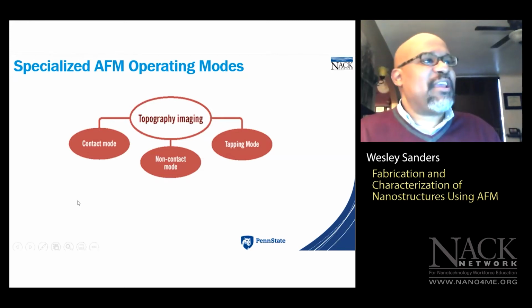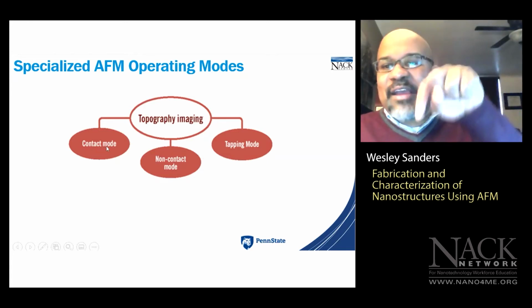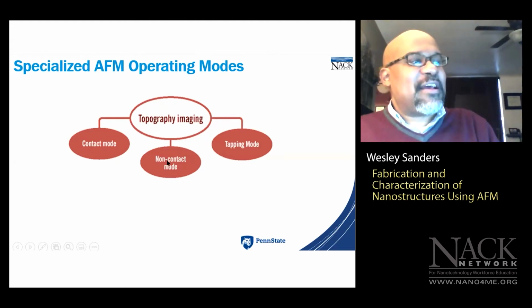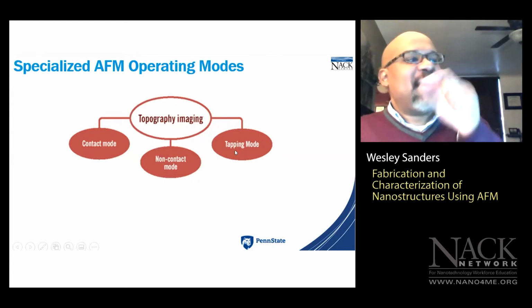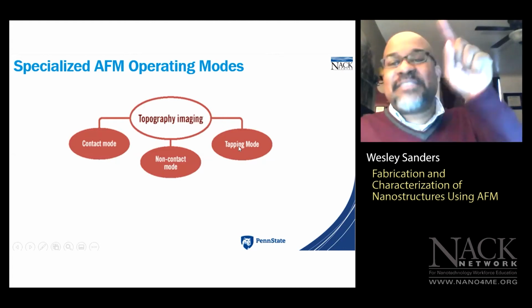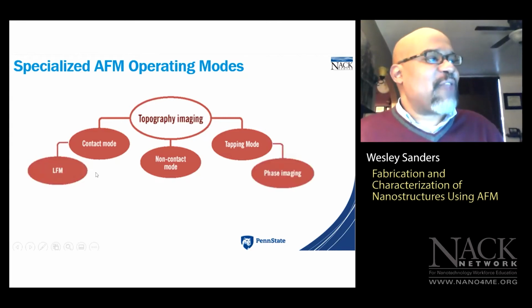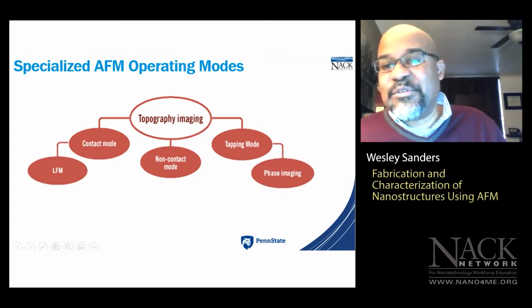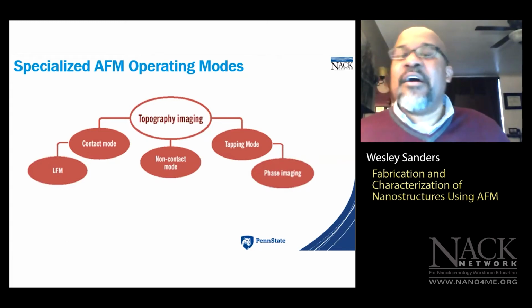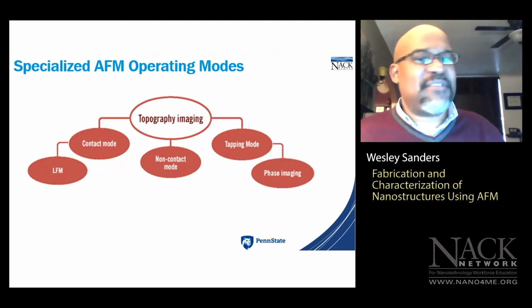But in any event, AFM generally has three main operating modes: contact mode, where the tip is making direct contact with the sample surface; non-contact mode, where we have an oscillating tip that's held about 1 nanometer away from the sample surface; and tapping mode, where the tip actually taps the sample surface. Now I'm going to focus on lateral force microscopy, LFM, and phase imaging. The reason I want to focus on those two imaging techniques in particular is because they are oftentimes used to image the nanoscale structures that are made using the fabrication techniques that I mentioned previously.